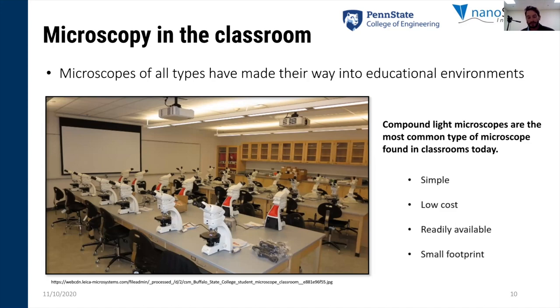So this is one of the reasons why this type of microscope has become so ubiquitous in the classroom. However, there's a lot of other types of microscopes out there, and many of them could benefit the student as well. We're going to talk about one of those today, that being the scanning electron microscope.